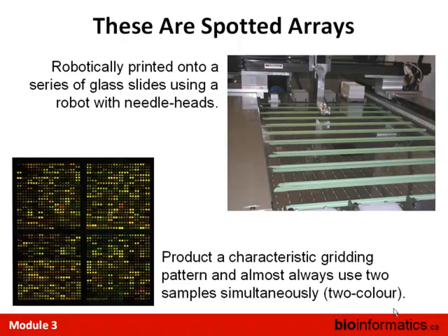You can almost always recognize a two-color microarray produced this way by the characteristic gridding pattern with spaces between the squares — each corresponds to a single run from the needle head. Over the course of a print run, the needles can wear down, and you can see a bias either across one print grid or within the spatial array. To do good bioinformatics, you have to understand the technology and know the sources of error — there are techniques for print grid normalization to reduce the effect of sequential needle degradation.